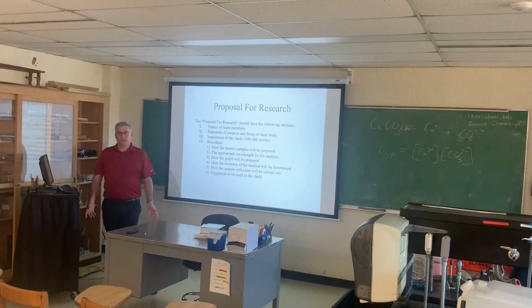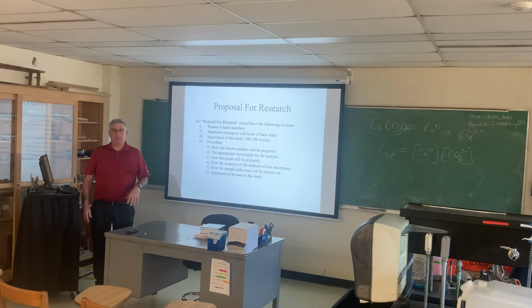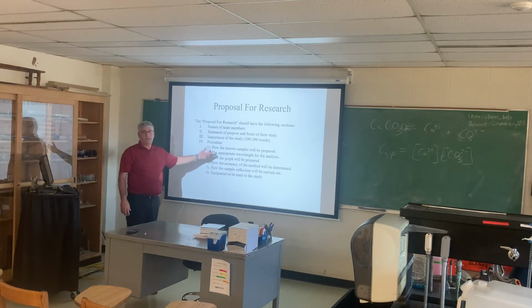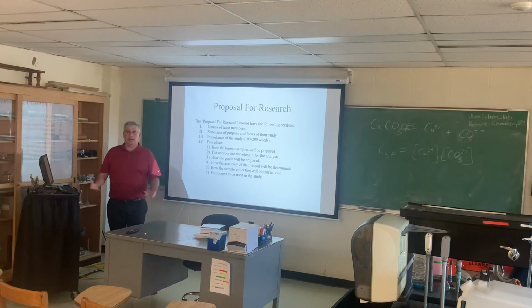I want each one of these ideas from 1 to 6 expanded into at least a full paragraph. That's the minimum, okay? Not one sentence, not one word. I want them expanded, how the known samples will be prepared. So that means how you're going to collect them, what are you going to keep them in, all of those things. The appropriate wavelength for analysis, how you found that. You're going to find that in lab this week.